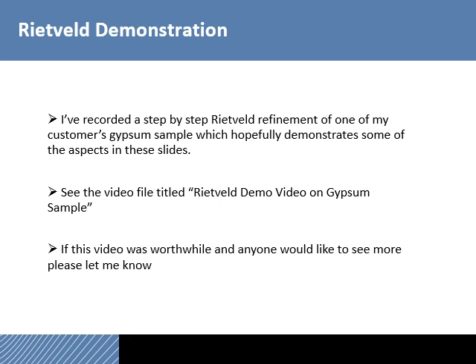I opened the file, I fit the background to it, I did a search match on it. Unfortunately, I did it at home this weekend, so I didn't have access to the PDF. So I had to use the COD, the free database, but like I said, it's sufficient for this kind of analysis. So I did a search match, I identified the phases, and I tried my best to walk through a step-by-step Rietveld refinement and show what I mean by turning on or turning off parameters.